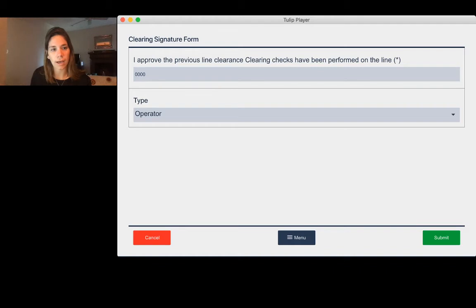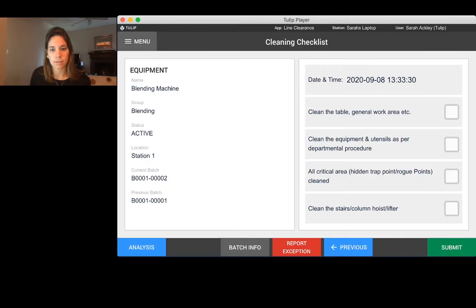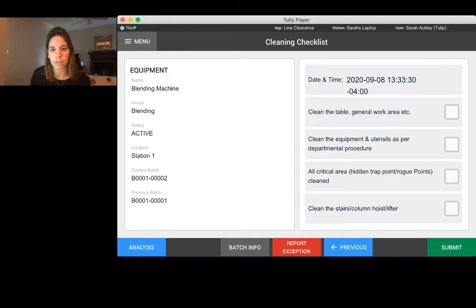We go ahead and confirm, and now we've moved on to the cleaning checklist. You can see it's storing the new timestamp, and then I can go through and perform my checks.